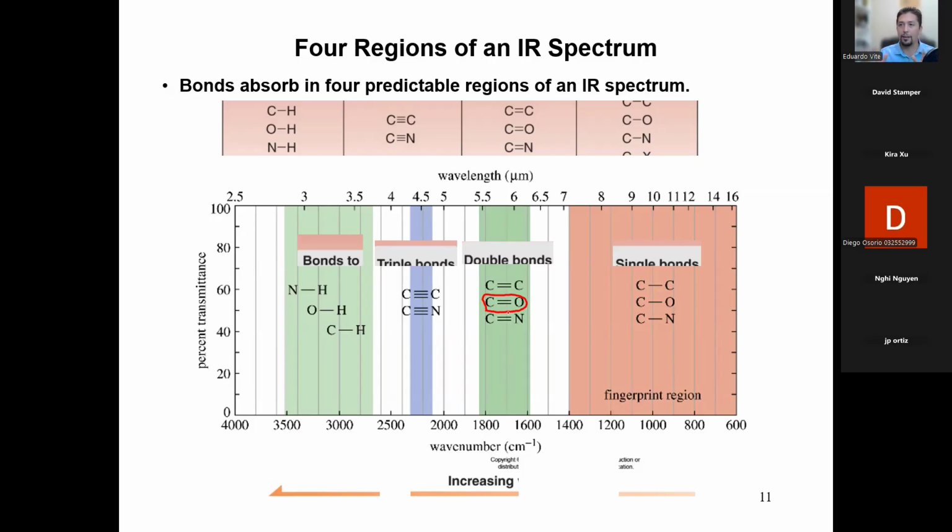That one is so iconic and characteristic that you can't take organic chemistry without ever hearing about the carbonyl peak. And that one is usually found between 1600 and 1800, depending on whether it's a ketone or a carboxylic acid or an amide or an aldehyde. It depends, but it's still going to be within that region. This is also not 100% absolute. This is chemistry. There's always that one tiny little exception, but for about 95% of the cases, this chart is generally true.